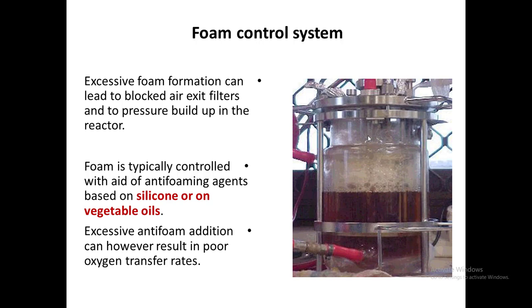Foam is typically controlled with the aid of an anti-foaming agent based on silicone or vegetable oil. Excessive anti-foam addition can result in a poor oxygen transfer rate that can lead to poor fermentation, and our product is not formed by the conversion of substrate into product.